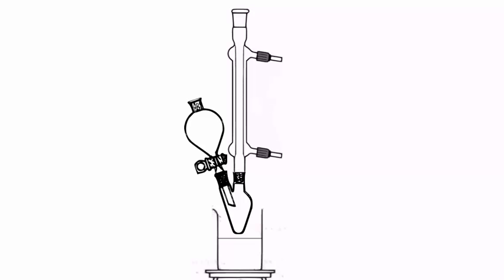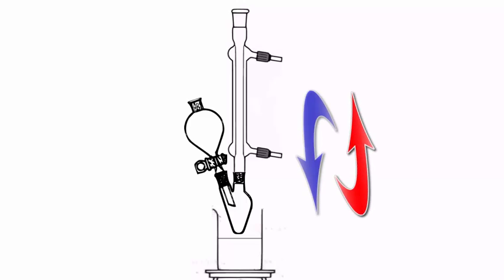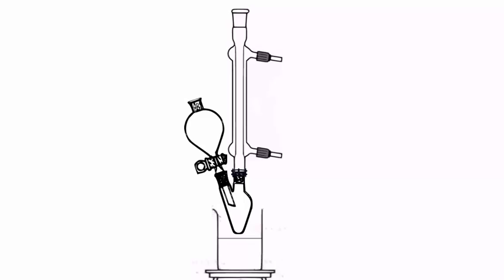Then I attach a Liebig condenser in a vertical position that will condense any vapor leaving the flask and return it to the flask. Attach one of these Keck clips to fasten the Liebig condenser securely to the flask.